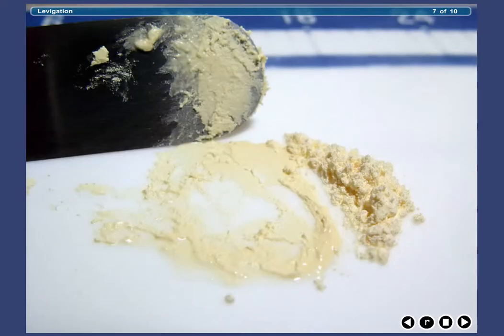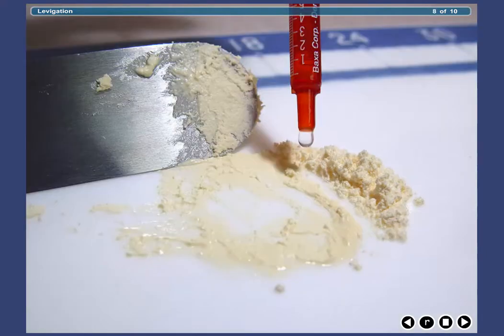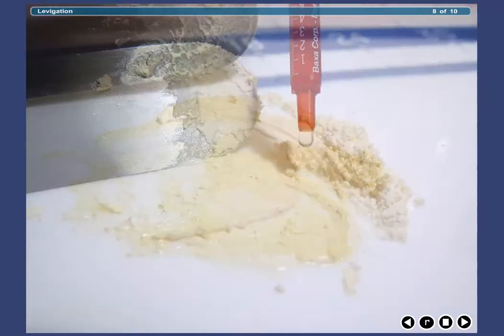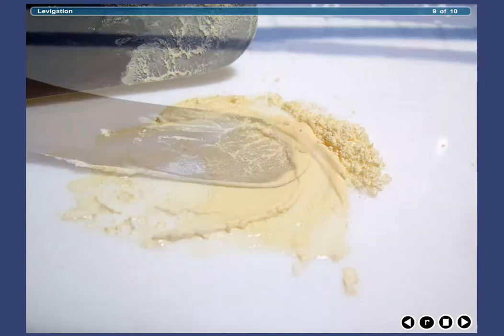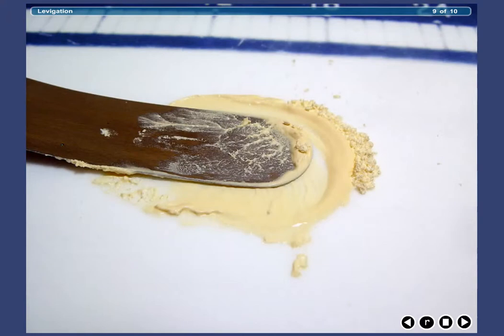The spatulation process is continued until no more solid can be incorporated into the initial volume of this levigating agent. At this point, another addition of levigating agent is made and the spatulation process is continued as previously outlined. This process is continued until all of the solid has been incorporated with the levigating agent.